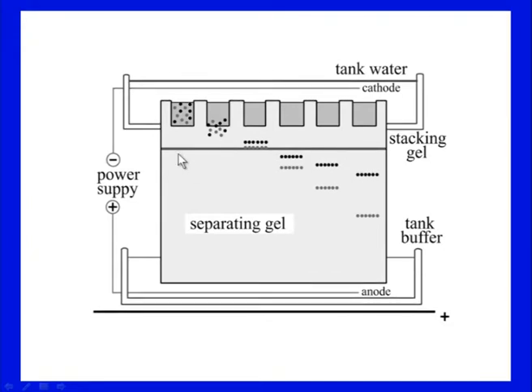If you can see, most of the plate is covered with separating gel, and there is a very small part of stacking gel here. You load your samples in these wells, and these samples are distributed here, big and small, but they form boundaries here, thin zones. When these thin zones enter the gel at the interface into the resolving gel, they will separate according to their size and charge. So, this is how the discontinuous system works actually. It is very well depicted in here.